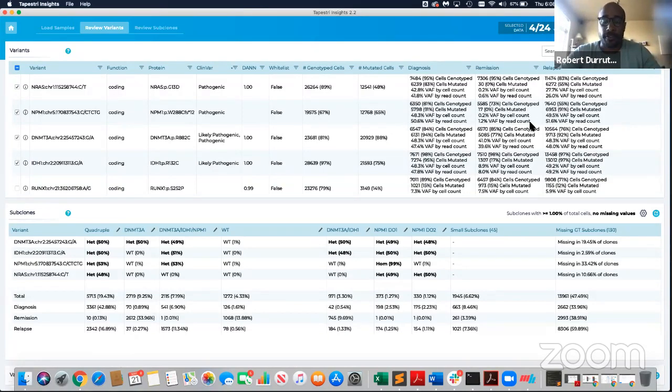If you work with melanoma samples, for instance, you expect more variants because patients are inflicted with a larger fraction of variants in comparison to heme malignancies, where you would only expect a handful of variants at a given time. I think this is a patient series linked to an AML case where you would only expect about 4 to 5, maybe 6 variants at a given time.